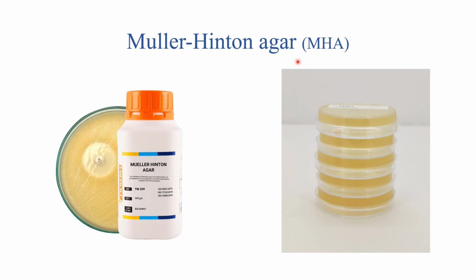Mueller-Hinton agar or MHA is used for antibiotic susceptibility testing in this diffusion method.